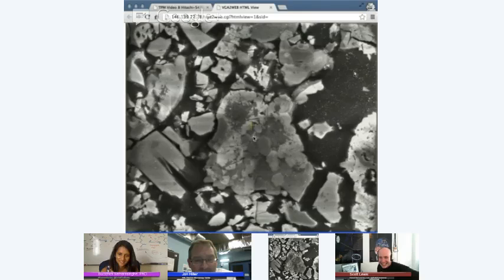Scott, could you point to the aluminum for our viewers? Exactly. Right there, there's two. That's the aluminum. The bright areas are calcium. So the brighter albedo right here. What's the really bright stuff? The really, really bright stuff? It's calcium as well.